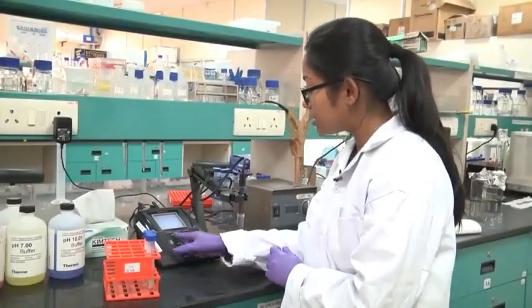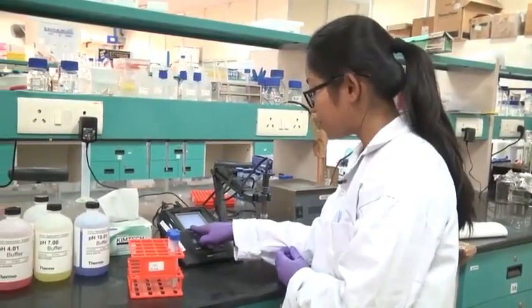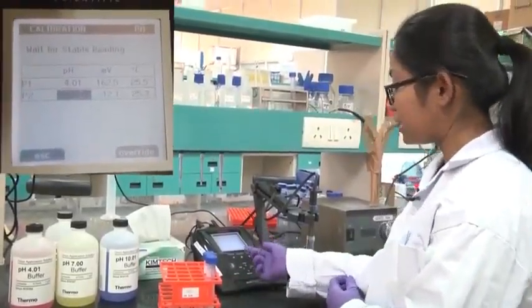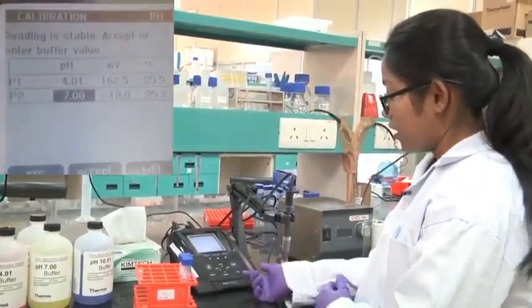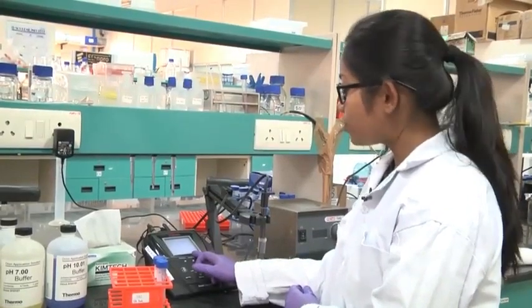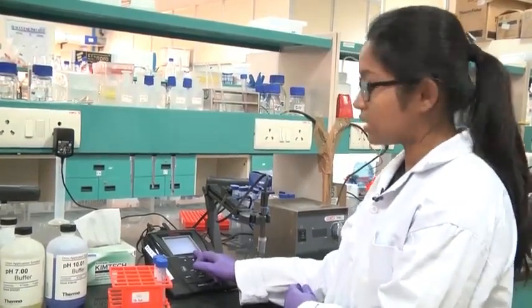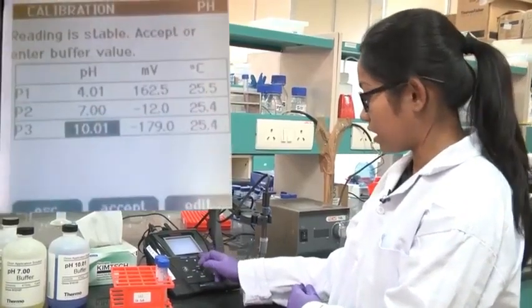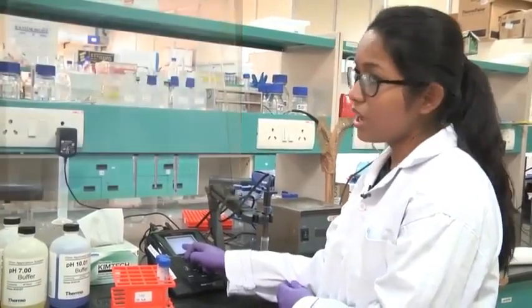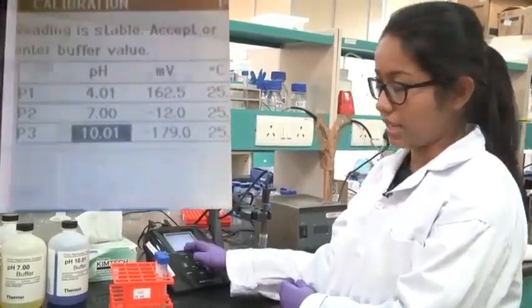And then on this monitor there is a calibration setup, and we will press the calibration setup, and now it will show one point. If you then start, it will start getting the pH of that particular solution. Now you have to wait for some time before the reading becomes stabilized. Do not rush here, otherwise it might be inaccurate. This is blinking right now. Until it stabilizes, wait.